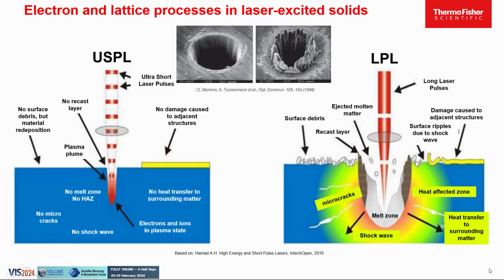Here is the comparison graphics of ultra-short pulse laser and long pulse laser. By shortening the pulse duration, we can suppress all thermal and other resulting effects, therefore allowing athermal material removal.